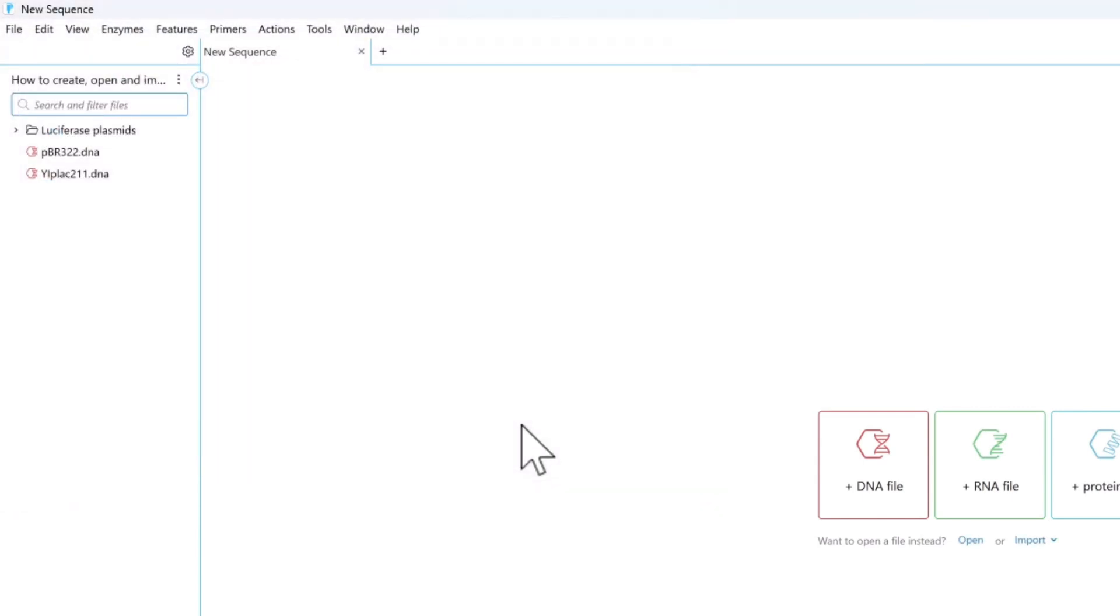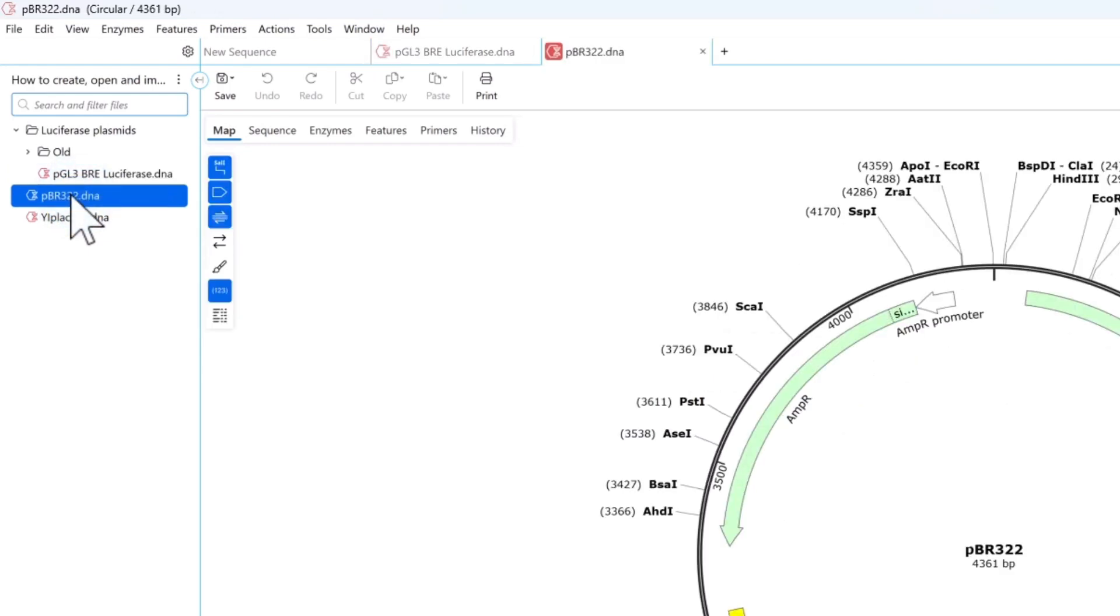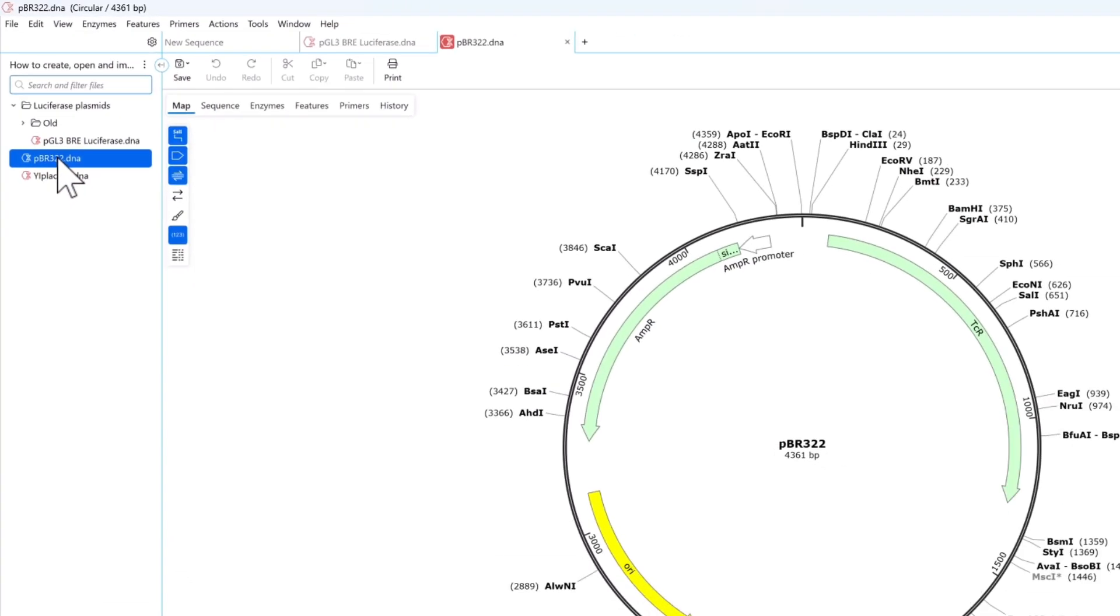The project side panel displays the folder with all the files it contains listed. Select a file to preview it, or double-click to open in a new tab.